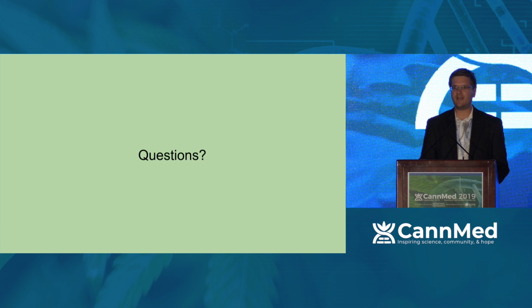When you're making tissue culture media, there's no antibiotics. You're basically creating a cocktail that everything loves to grow in, including fungus and bacteria. So you're perpetuating the problem if you add those inoculants right before you take the culture itself.